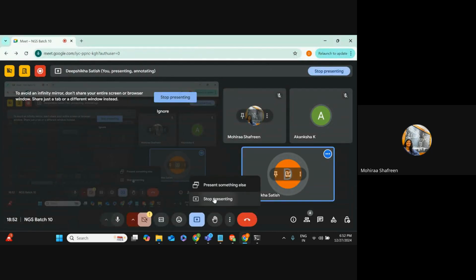What are these files, ma'am? These are only the binary language, okay? 0 1 1 like that. But we cannot read that as a human, okay? The tool can read it. It is just converting the FASTA sequence into the binary format. That's it.